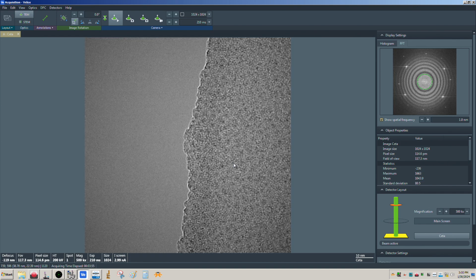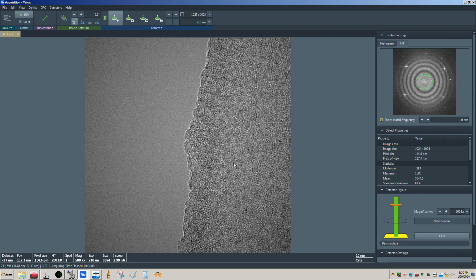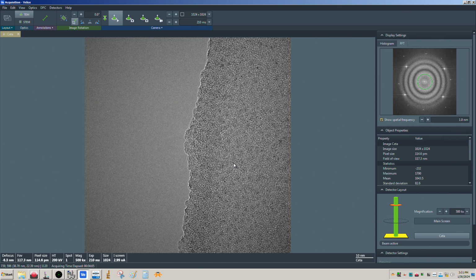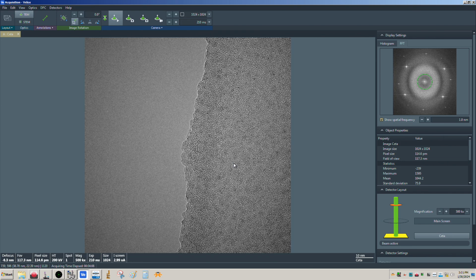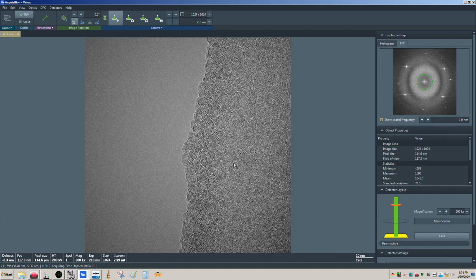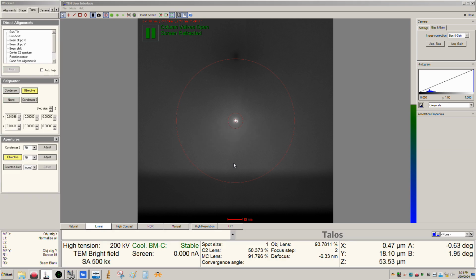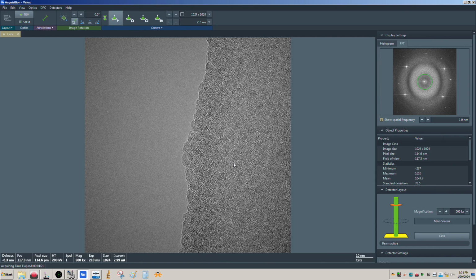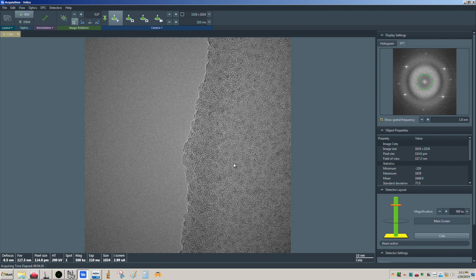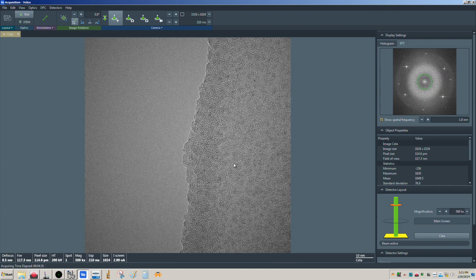Now you can see the focus here. I can set the defocus back to 0. So we're getting a little bit of settling here, probably with the sample. Okay, let me see if I can focus with the Z. Okay, that's pretty close right there. There's a little bit of astigmatism still now, I think. That again is going to vary with time. It doesn't stay good forever once you correct it. Okay, so that looks pretty good right there. The focus is pretty good here.